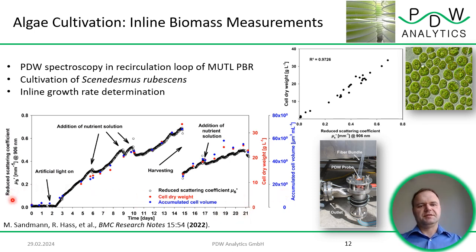And what we see here in black is the reduced scattering coefficient as function of time, and reference analytics in red and blue for cell dry weight and accumulated cell volume by sample taking. And what is nicely seen by the inline signal is that growth, cell growth and biomass growth, can be measured nicely as function of time.